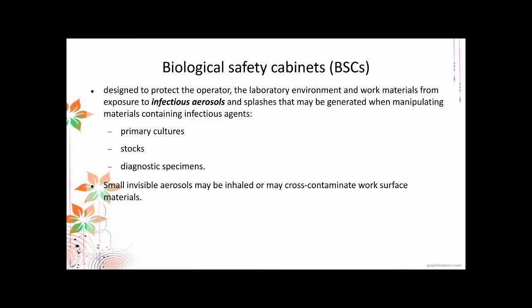Small invisible aerosols may be inhaled or may cross-contaminate work surface materials. So you need to prevent those aerosols from getting out of the laboratory, or even the containment area, which is your BSC.